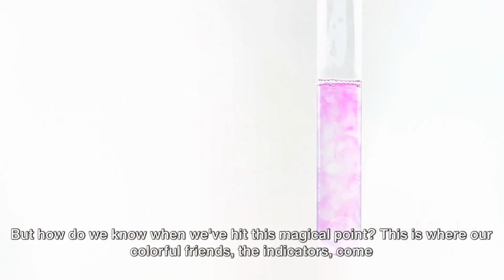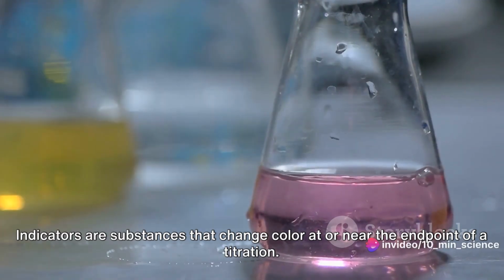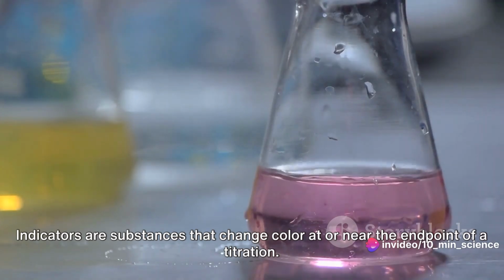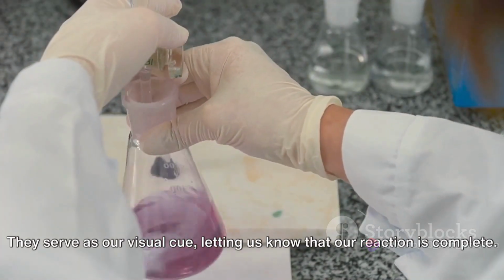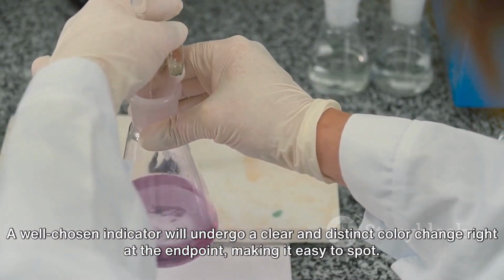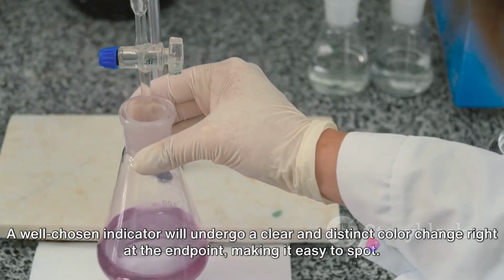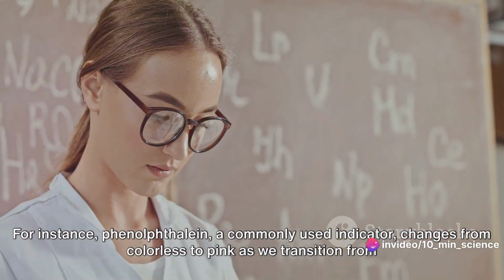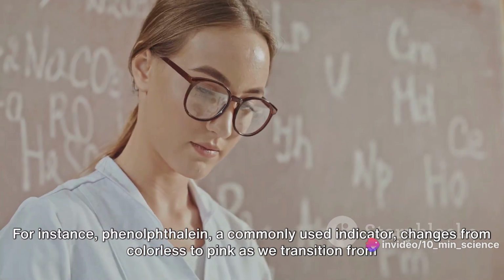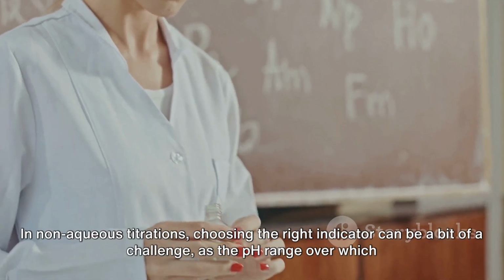But how do we know when we've hit this magical point? This is where our colorful friends, the indicators, come into play. Indicators are substances that change color at or near the endpoint of a titration. They serve as our visual cue, letting us know that our reaction is complete. A well-chosen indicator will undergo a clear and distinct color change right at the endpoint, making it easy to spot. For instance, phenolphthalein, a commonly used indicator, changes from colorless to pink as we transition from acidic to basic conditions.